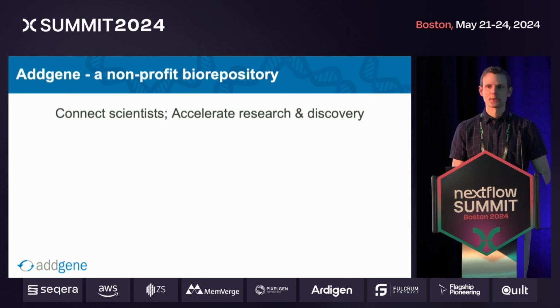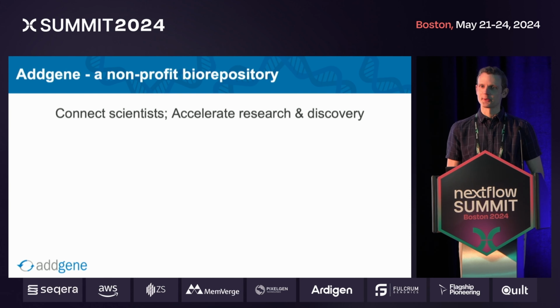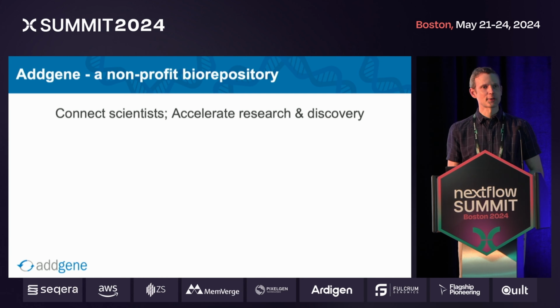So Addgene is a nonprofit biorepository. We started in 2004, partly as a result of one of our co-founders' experiences trying to request materials from other laboratories for her research in graduate school. And so Addgene was started as a plasmid repository to make it easier for scientists to share those kinds of DNA-based materials.